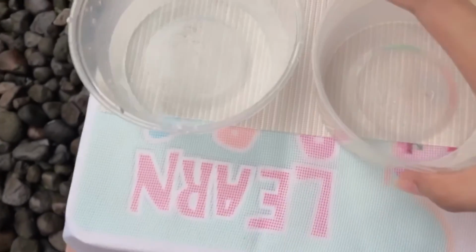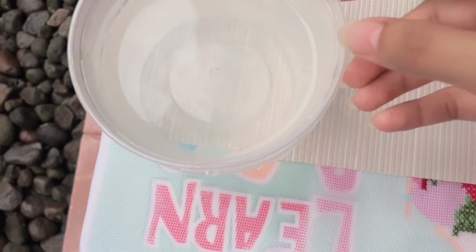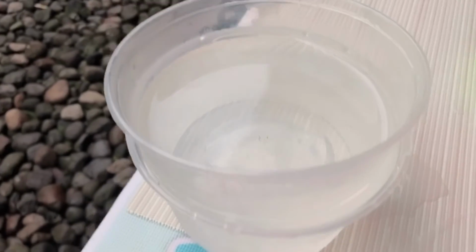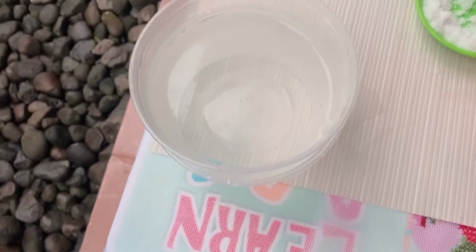After all has dissolved, we chill the glass in cold water. This cold water is used to restore the temperature that has risen, which had increased the solubility of the salt. Then we wait for a moment until the temperature of the solution is back to normal.